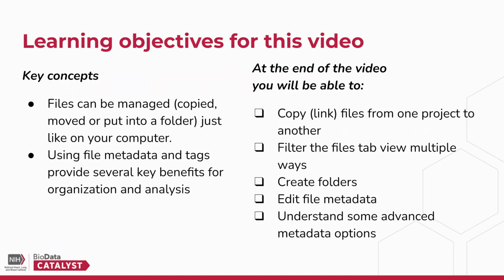analysis. At the end of the video, you should be able to copy or link files from one project to another, filter the Files tab view in multiple different ways, create folders or subfolders, edit a file's metadata, and finally, understand some advanced metadata options that you can use in your analysis.